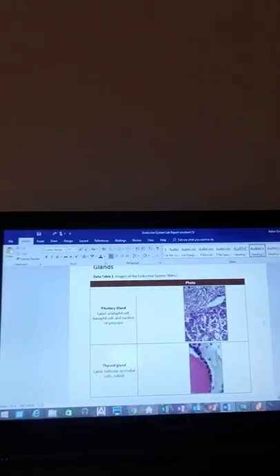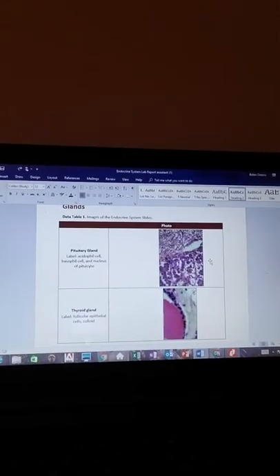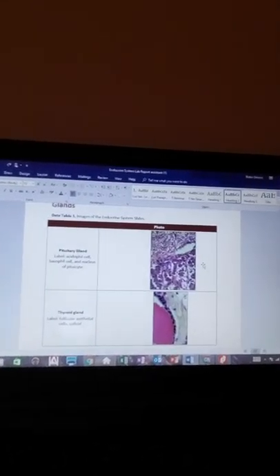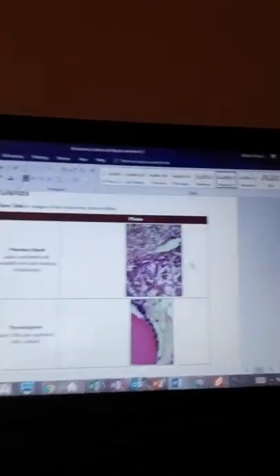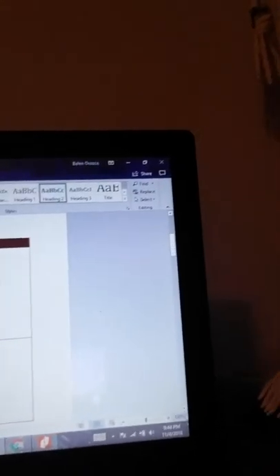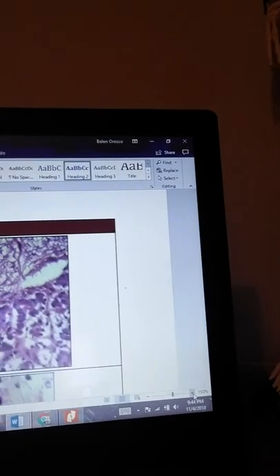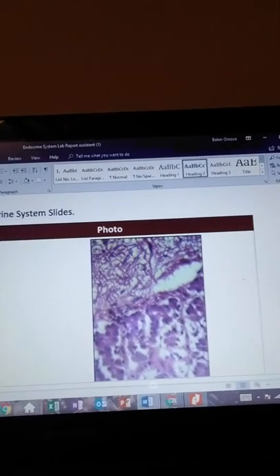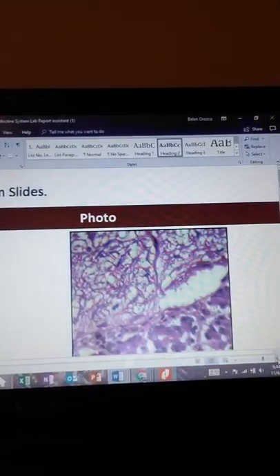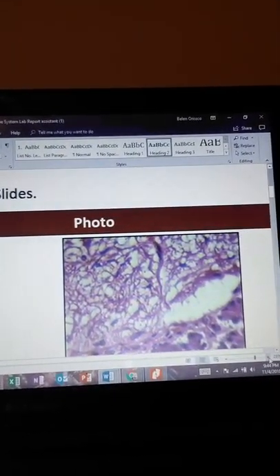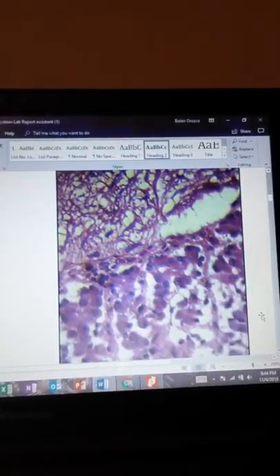So you can see that here's my slide, here's my image, and I can't really see the cells that well because they're way too small. So I went ahead and went down here to the icon to zoom in my image. I'm just gonna keep zooming in until I can see the slide clearly. There you go.